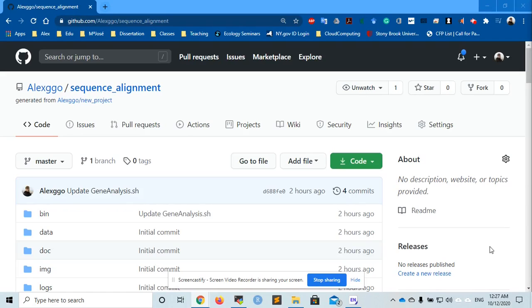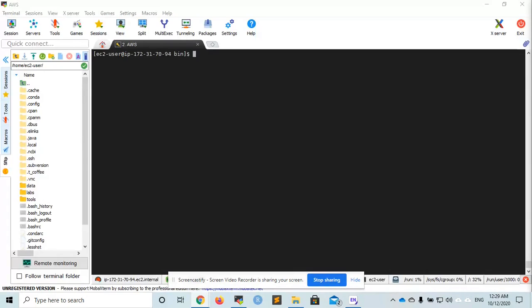Hi! In this video, I will show you how to do multiple sequence alignment in the terminal.